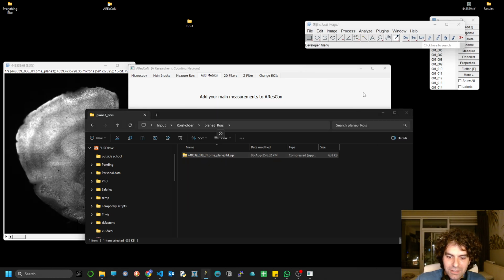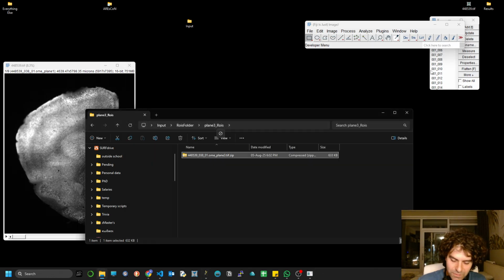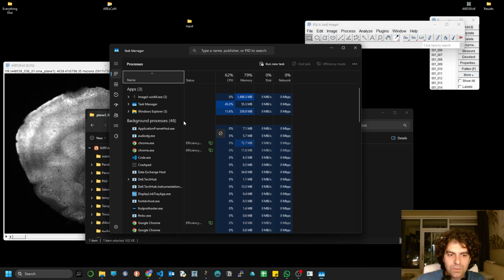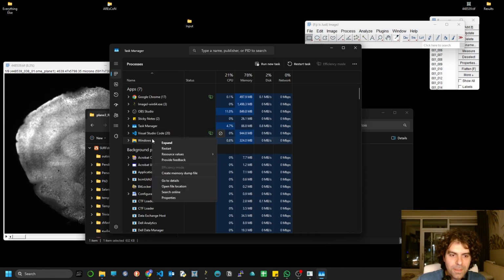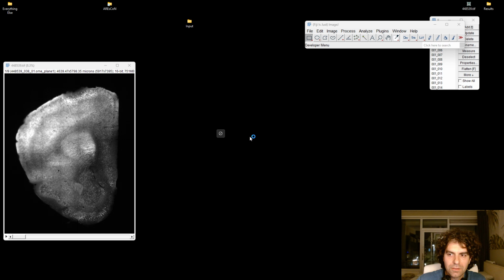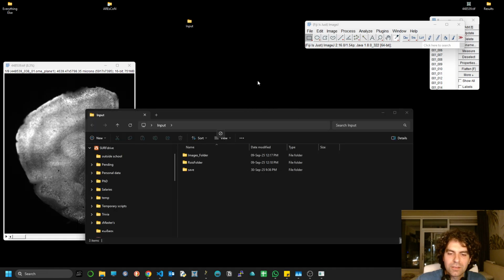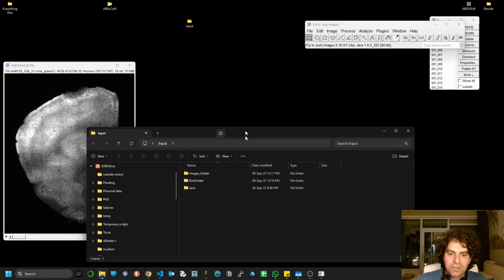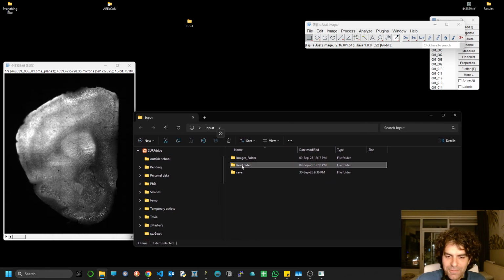Let's try to overcome this problem. I'm going to close the Windows Explorer. Now maybe restart. Okay. Try to refresh our image. Okay, sorry about that signal. It is annoying. But let's continue.